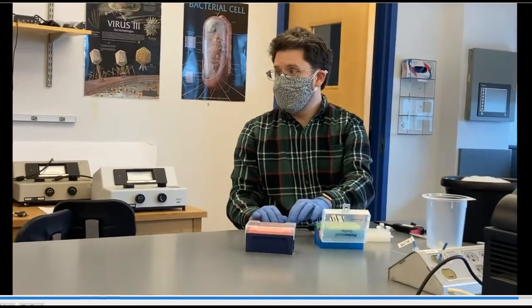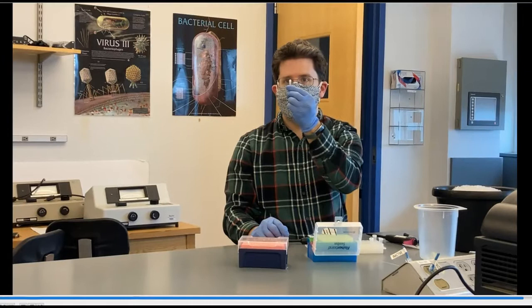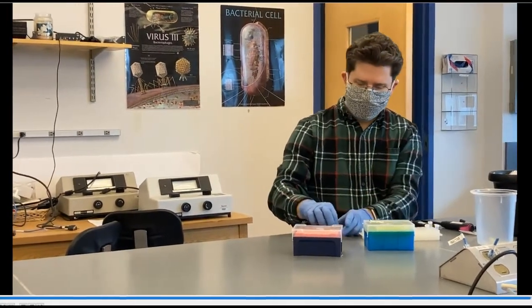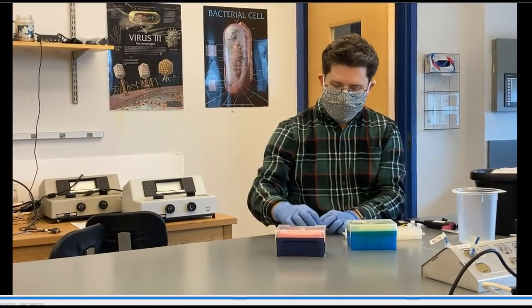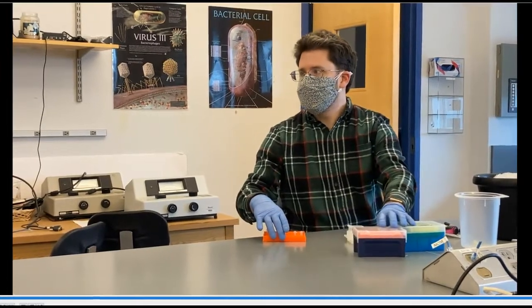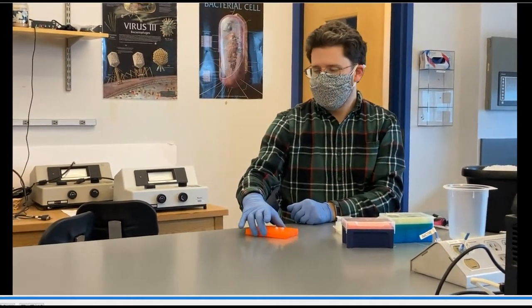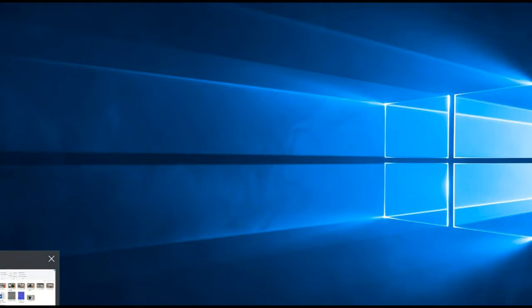Now go ahead and close both of those little tubes. Before we put them into the thermocycler, always inspect them to make sure there's nothing on the side. If you do have any drops, that's fine — you can just tap the tube and that should force the liquid to go down to the bottom.